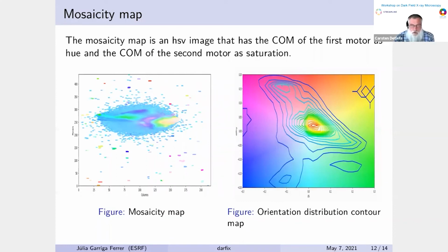With the plastic lenses, as Mats has also pointed out in his presentation already, there are no grain boundaries, but there are quite a lot of long wavelength aberrations, and those should be possible to fit and potentially remove with the Fourier ptychography algorithms if they work perfectly, and in particular if the data acquisition, the tracking of all the 6 motors, works perfectly. Does that answer the question? I would say that answers the question.